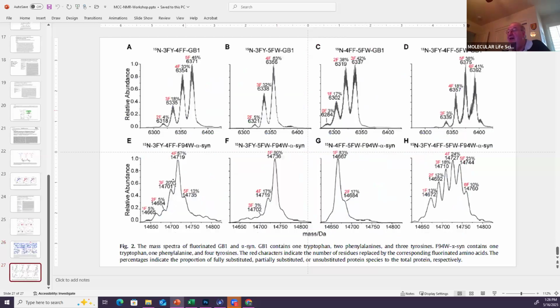And then the final one is, of course, the other way of checking that you've got the, excuse me, talking too much, is to use mass spectrometry. And this is the approach we use in our upper level biophysics. We get the students to do a series of experiments that involve mass spectrometry, crystallography, and NMR, so they can see how you can piece all of these things together.